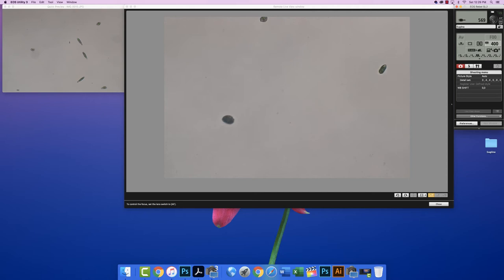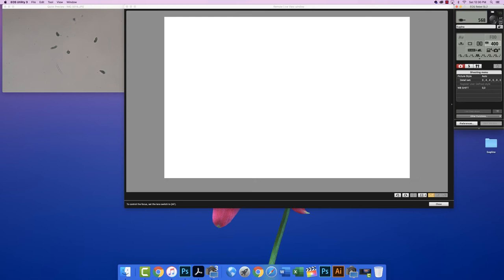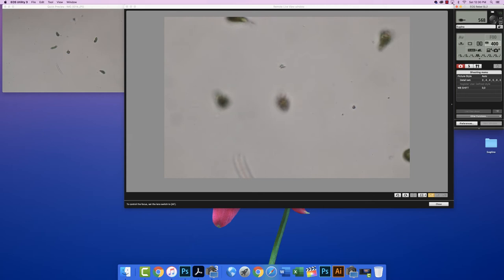So you can see it slowed them right down to a stop. Maybe they don't like it very much because they kind of balled up. And there's fewer Euglena because we've diluted it with the Protoslo. Okay, but now let's see if we can get a shot. And now we can move up to 40x and get a little bit better view. And refocus. And we can make a little movie.